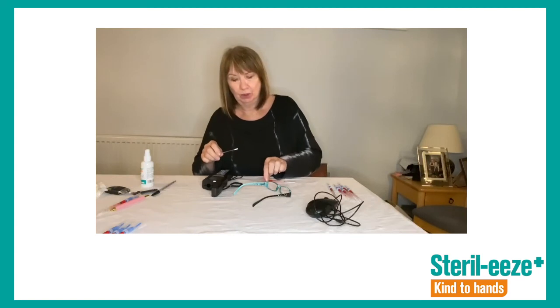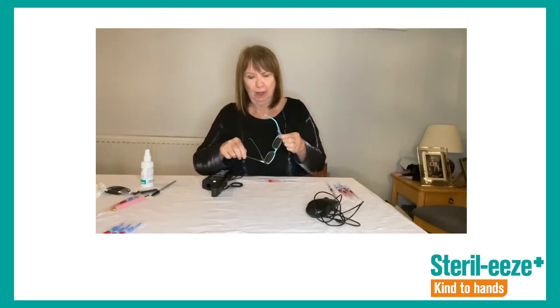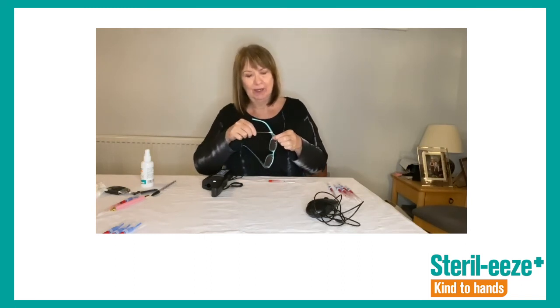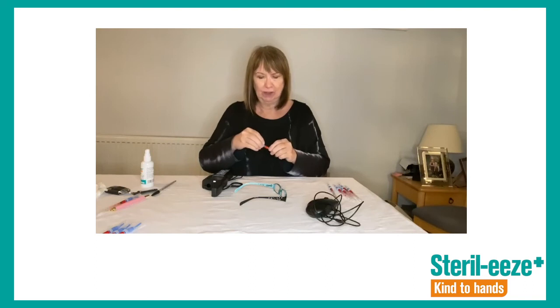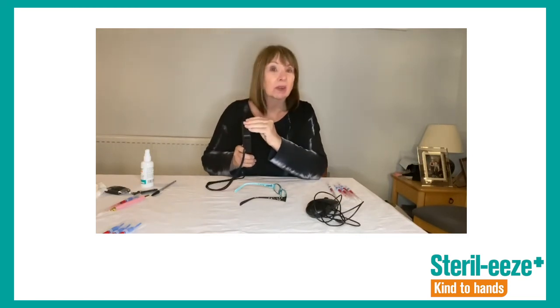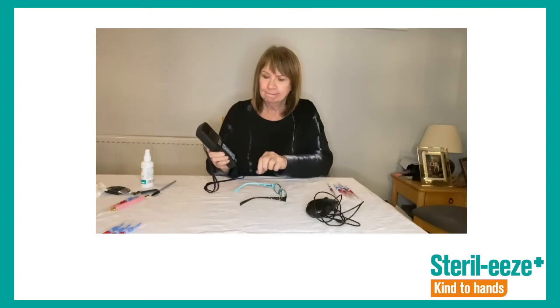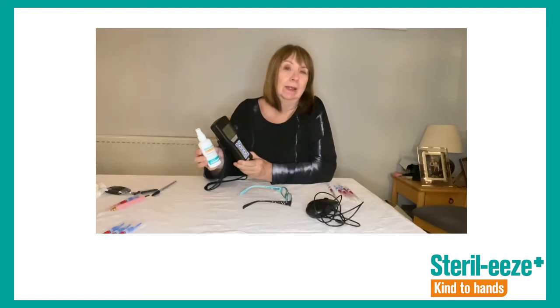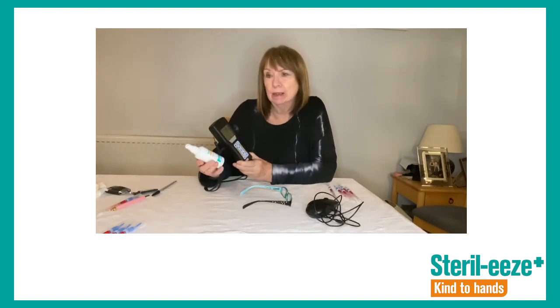So I'm just now going to swab the edges of my glasses, which is what I had in my mouth in a previous video. The reading on the previous video was 2,000 relative light units, which is equivalent to approximately 2,000 cells. So let's just see how effective this product's been. It's passed a lot of standard laboratory tests, and often when you use them in practice, you don't always expect to see exactly the same sort of result.